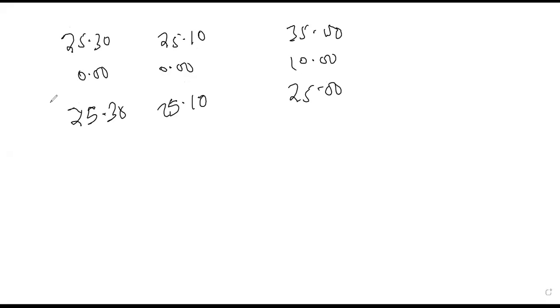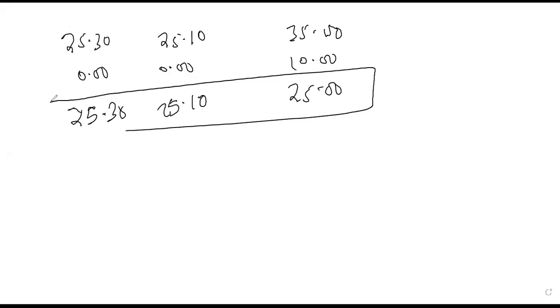We are saying that these burette readings, the titre values, should never all be the same. Of the three, two can be the same.